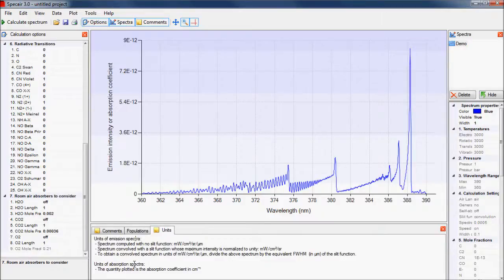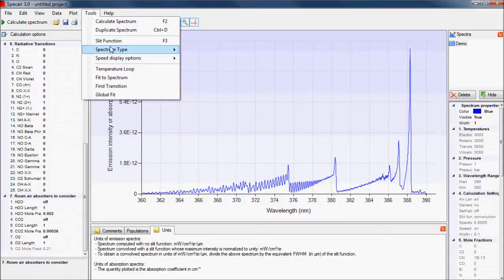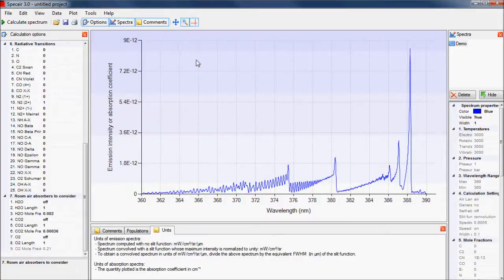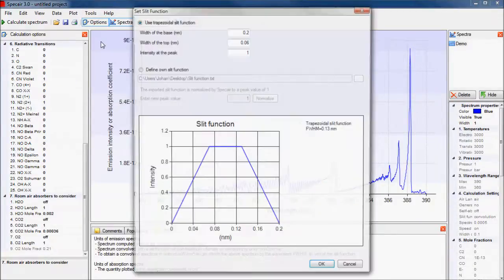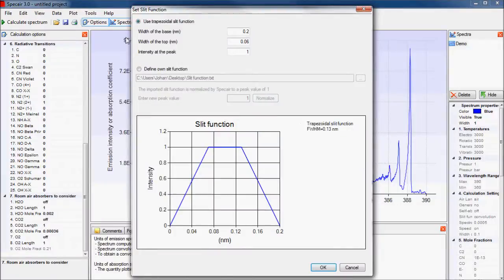To calculate an absorption spectrum, select absorption under the spectrum type in the tools menu. In the same tools menu, we can also change the slit function, which represents the broadening of lines during the measurement. You can choose between using a trapezoidal slit function or an imported slit function.